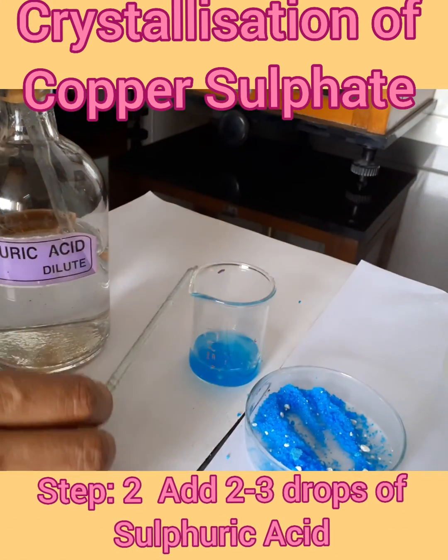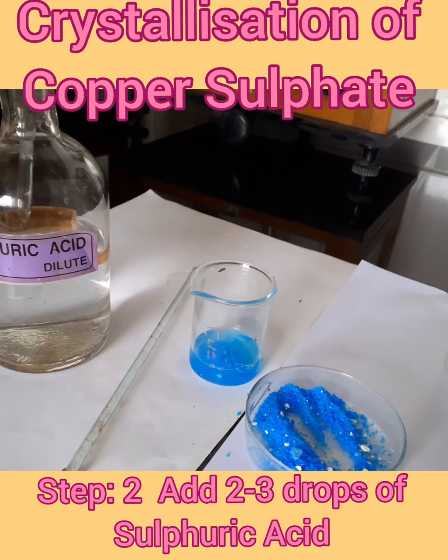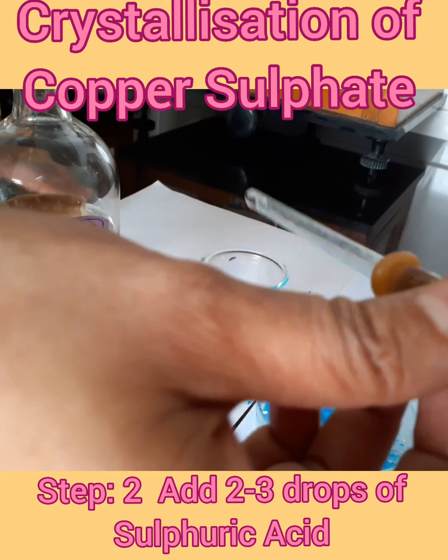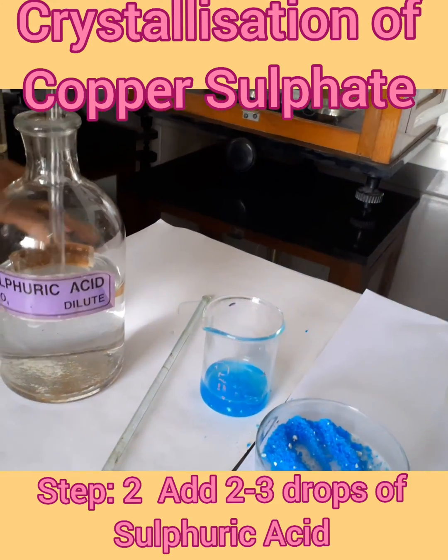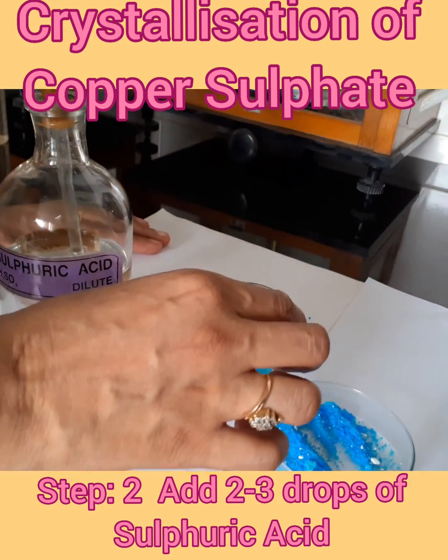Then we have to add two drops of dilute sulphuric acid. You will understand this in higher classes, but it is important for the crystallization of copper sulphate.